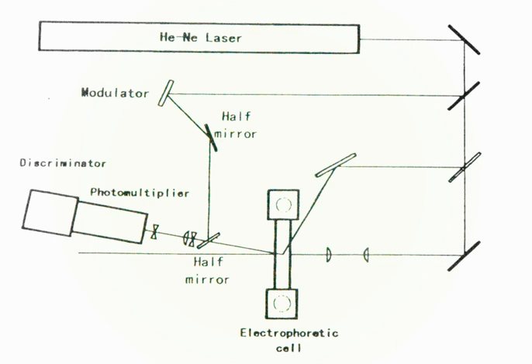This method is used for measuring electrophoretic mobility and then calculating zeta potential. Instruments to apply the method are commercially available from several manufacturers. The last set of calculations requires information on viscosity and dielectric permittivity of the dispersion medium. Appropriate electrophoresis theory is also required. Sample dilution is often necessary in order to eliminate multiple scattering of the incident laser beam and/or particle interactions.